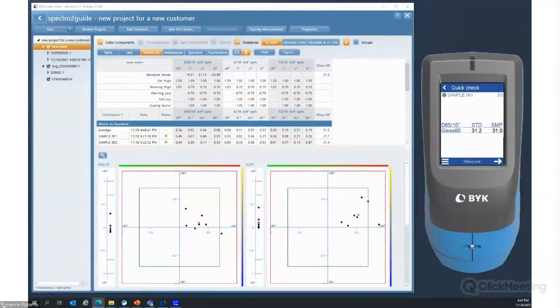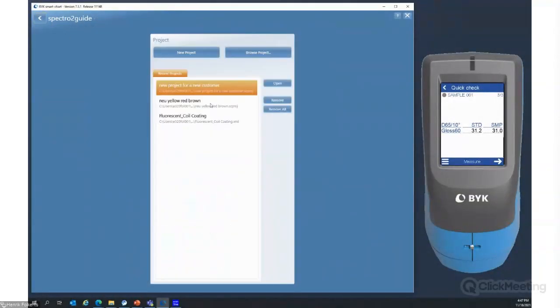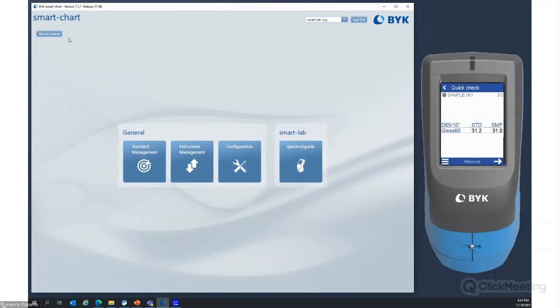How do you add a virtual instrument to your instrument list? It's designed to show up there. You know, the virtual instrument has an address, and I can key in this address. I will show you, it's not a secret.